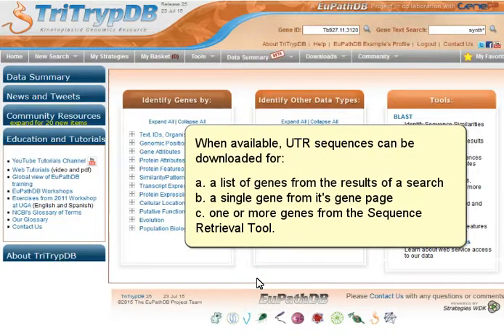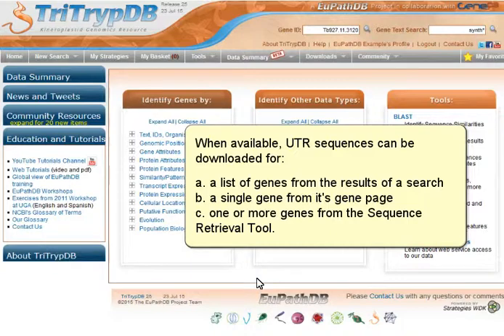When available, UTR sequences can be downloaded for a list of genes from the results of a search, a single gene from its gene page, or one or more genes from the sequence retrieval tool.